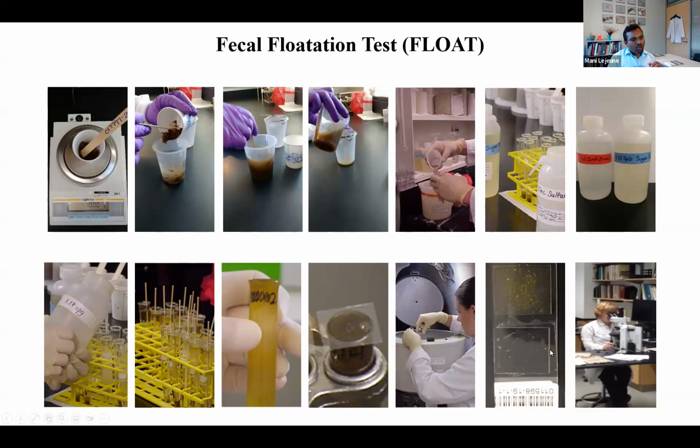At the end, whatever parasite stage we are counting or looking at under the slide would amount to parasites or eggs present in 1 gram of feces. Does that clarify? Basically, you want people to send you at least a 10 gram sample. Yes, we want people to send us at least 10 grams because parasite stages are not properly dispersed throughout the fecal pellet or the fecal sample.